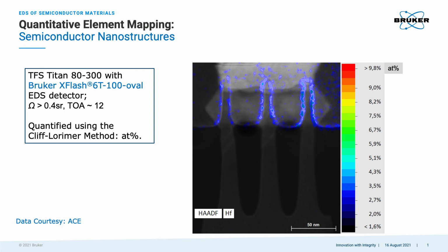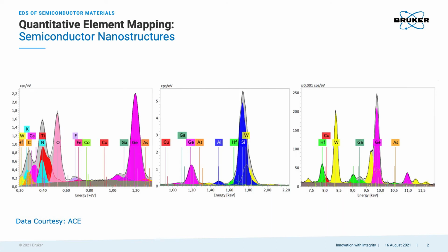That is a more simple deconvolution technique, doing just several iterations to be fast, and one can check on the fly how the tungsten, silicon, and hafnium, for instance, can be separated. Some overlaps need more iterations and a proper quantification step. But once the quantification procedure is set up, it's just push a button, and the quantification runs for a minute or a few minutes, and the elements are really well separated.